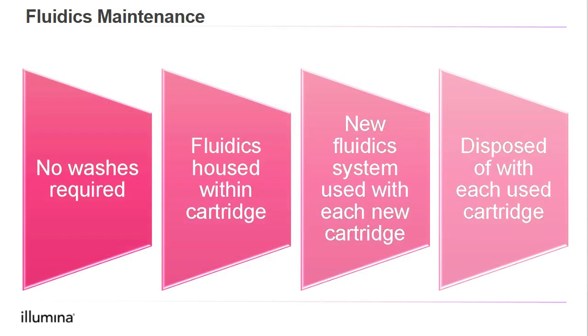As I discussed when talking about the reagents, there really is no fluidics maintenance on the instrument. No washes are required. The fluidics is housed within the cartridge. A new fluidics system is used with each new cartridge, and then it's disposed of with each used cartridge.